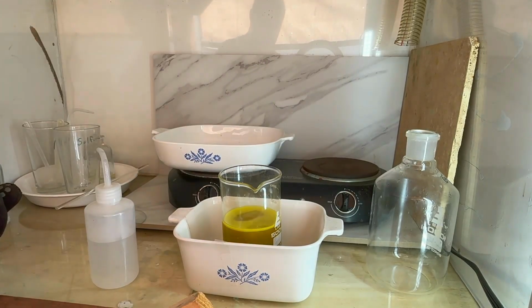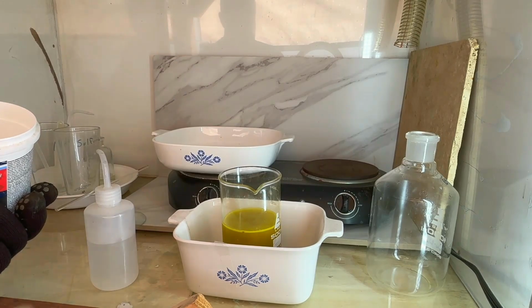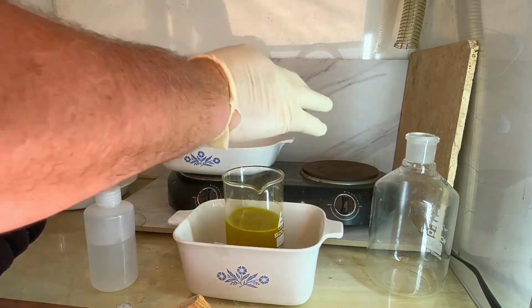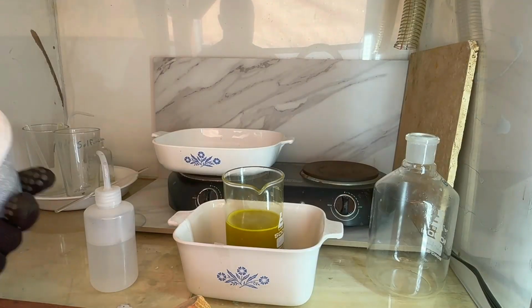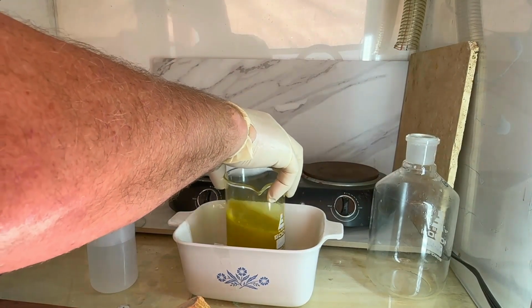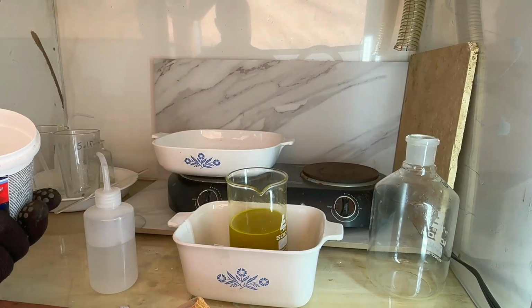We're just going to add it a little bit at a time. You can see it gets a pretty instant reaction. And we're going to keep adding this and stirring it until we get no reaction. This is best done warm. We're going to filter after this, so getting this done now, if you get in a little extra in there, crystals, if they don't dissolve, we'll filter them right out. But this will make it so when we do our drop, we get a nice clean drop.